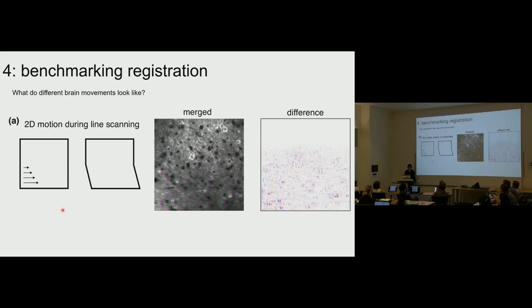Here's an example of a common movement: 2D motion during line scanning. For 2P imaging, you're line scanning your frame at different times. While you're line scanning, the brain might have moved — the mouse might have moved a lot in the middle of scanning. This means you get blur at the bottom of the frame but not at the top, producing a characteristic pattern in your difference image.